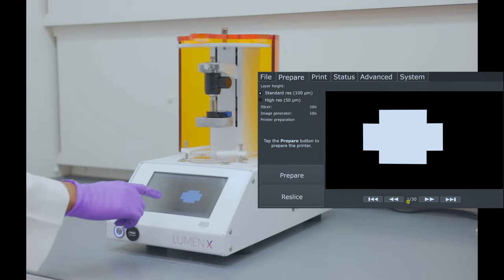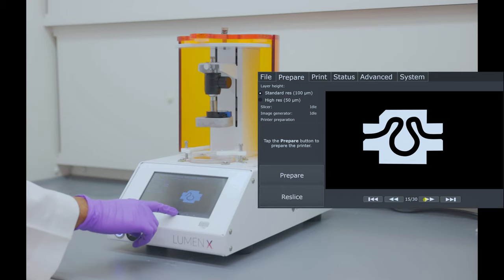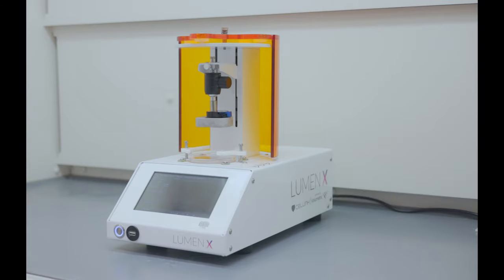We can preview the slices by scrolling through the layers. These slices are the images that are going to be projected onto the resin to build the object.